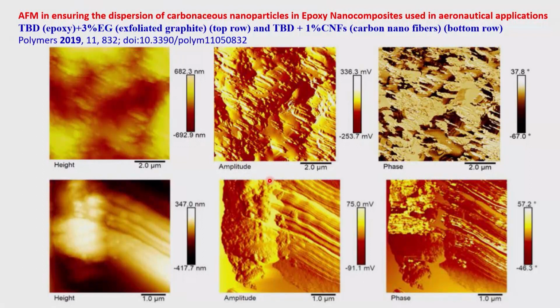So if you have more regions of stiffness, you can measure the mechanical stiffness and compare with different things. You can make different fill levels of this, measure their AFM, measure their stiffness, and then compare the mechanical parameters. As I told in the previous class, you can measure the mechanical properties, Young's modulus, the tensile strength, the mechanical strengths, and you can measure the conductivity, the charge flow, these potential differences. So a variety of parameters can be there, and for each of these you can map whatever sample you have on the surface.